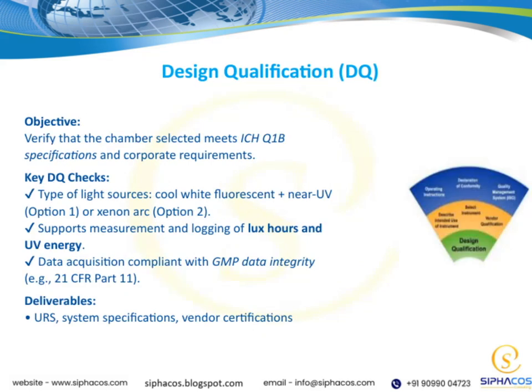Now, let's discuss the design qualification, or DQ, which is a crucial step in ensuring our chamber meets all necessary standards. The main objective here is to verify that the chamber we've selected aligns with the ICH Q1B specifications, as well as our own corporate requirements.